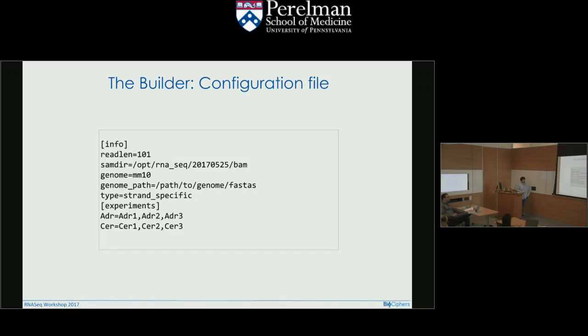Genome annotation is just important for some of the output files. We link to UCSC and things. This isn't that important, but it'll give you connectivity to things like UCSC Genome Browser later down the road.